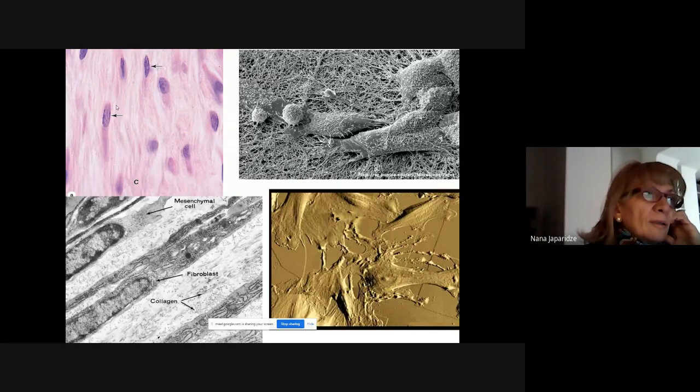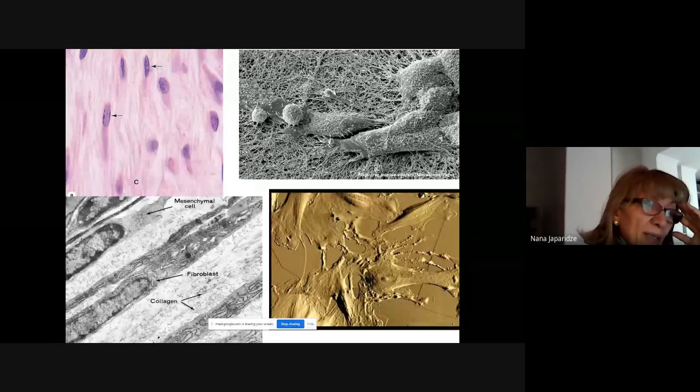Fibroblasts are quite active cells, and you see here the fibroblast in TEM images too, with its nucleus and cytoplasm. This is a small part of the cell, of course. Clearly visible here is the nucleus with a prevalence of euchromatin. In the cytoplasm you see rough endoplasmic reticulum, and also mitochondria.